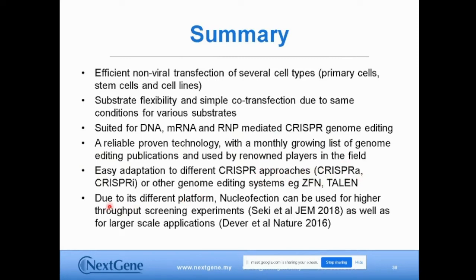Due to the availability of different platforms of nucleofection, it can be used for higher throughput screening experiments, as well as for large scale applications.